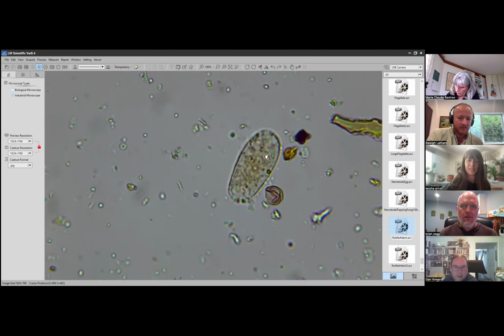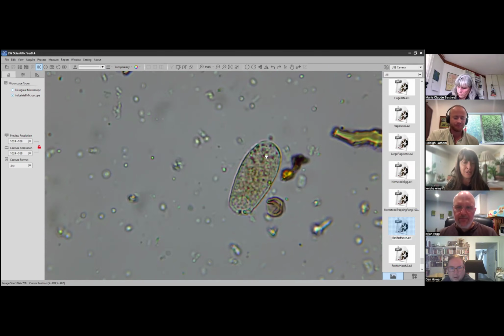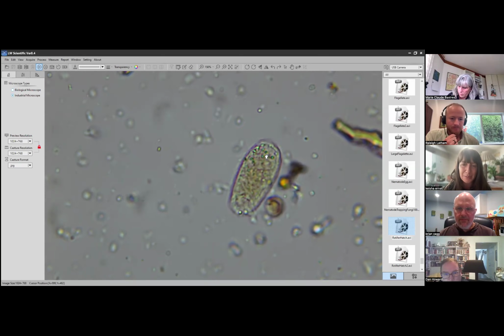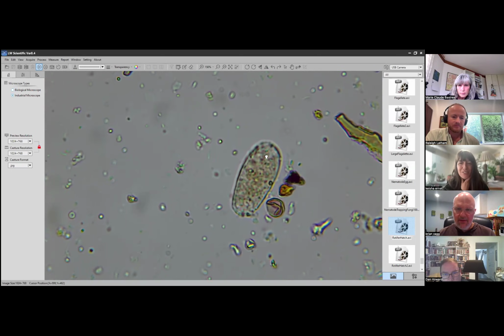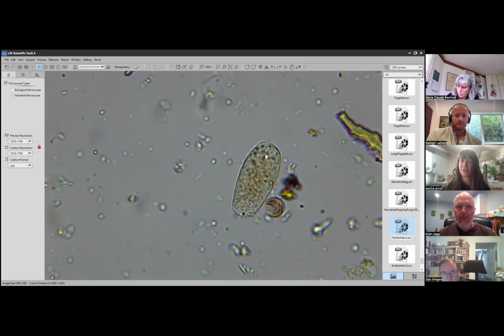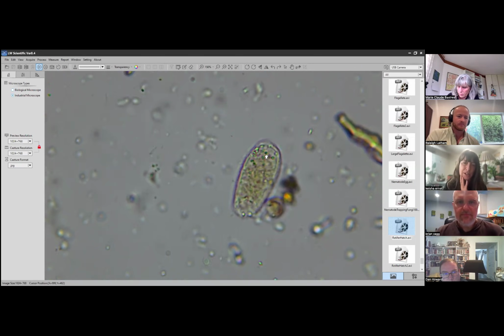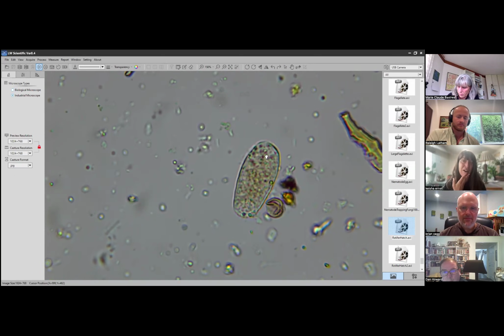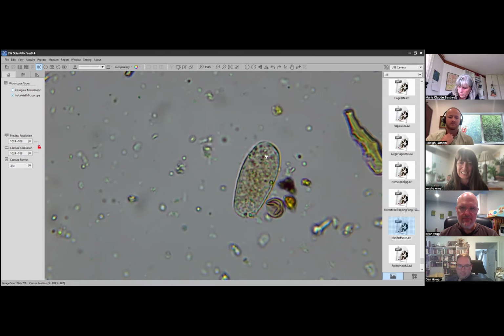Oh, there's a guy. Oh, nice. We could test any right there. Testate amoeba friend. Do you think that's a spore right there, right next to the testate amoeba? I think so. It looks kind of folded. Ellen asked, are the spores the round reddish things, dark or reddish brown, round? But spores can come in all shapes and sizes and colors, and often they're round, but they can sometimes even look like that little folded guy next to the testate amoeba.